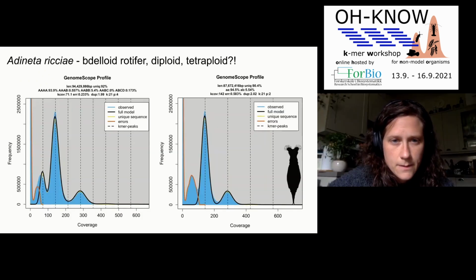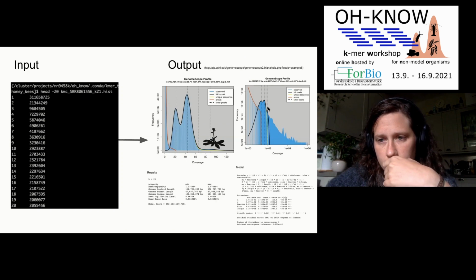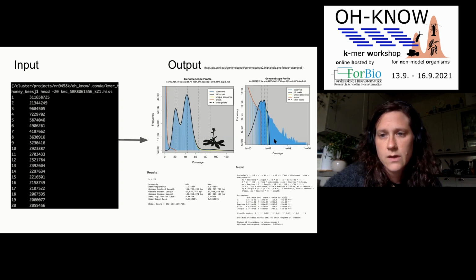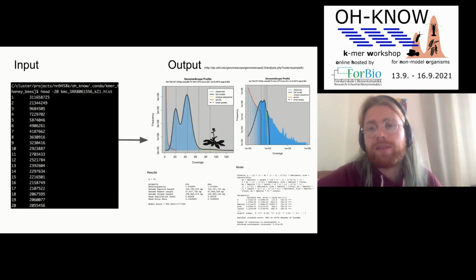Basically, correct me if I'm wrong, Kamil, but what you're telling it there is how much of the coverage your model will take. So do you want these Kmers to be in your model or do you not want them? If you want them, you tell the maximum to be over here. But if you don't, you tell it to be here. And that's going to affect the genome size estimation, for example, and the repetitive content. Kamil is going to talk about that later with one very illustrative example that he has, but it's a very good question. We'll talk about repetitive Kmers later on.